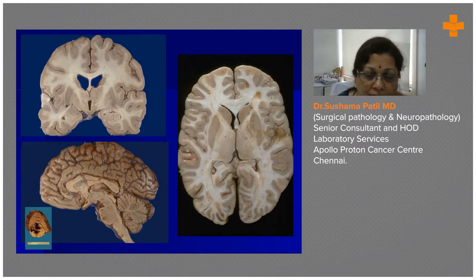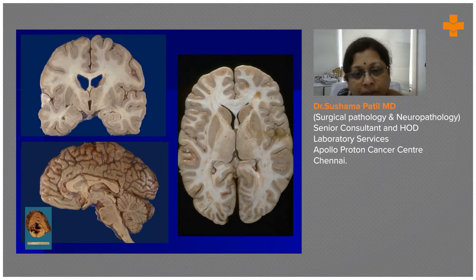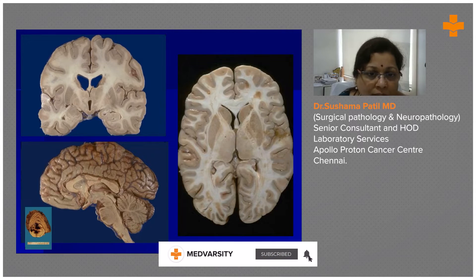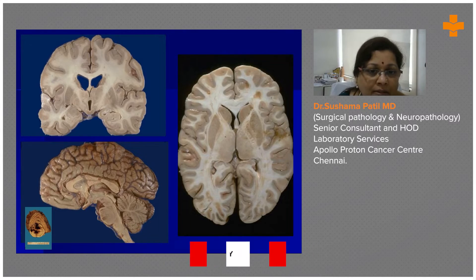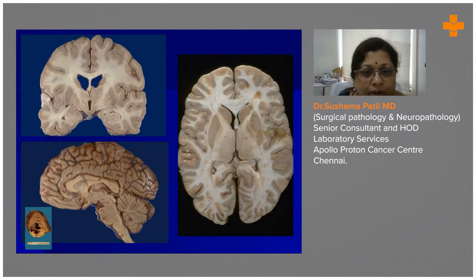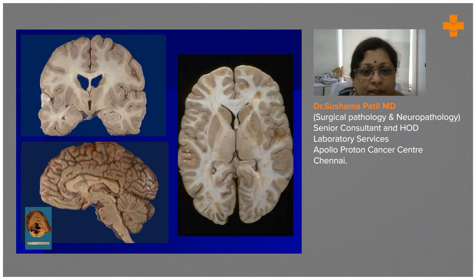This is the third ventricle, beautifully visible in this plane. The aqueduct and fourth ventricle are difficult to visualize here. You can see the hippocampal formation here — slightly anterior so the cornu ammonis pattern is not visible. Here are three structures: globus pallidus interna, globus pallidus externa, and the putamen, with pencil fibers coming out. You can see the white matter, the beautiful cortical ribbon showing the fine line between cortex and white matter, the Sylvian fissure, and the insular cortex. This is the temporal lobe.